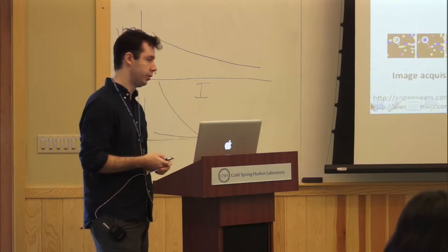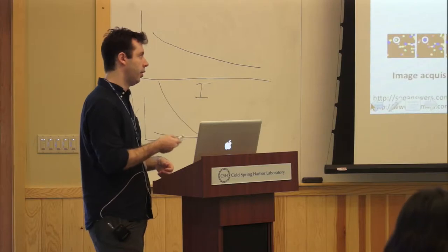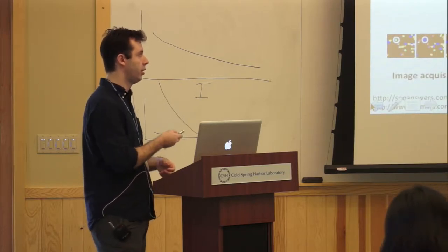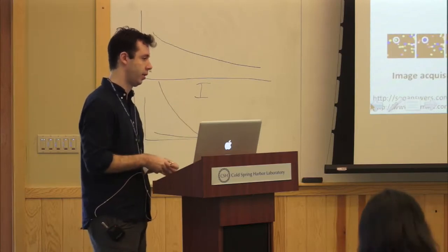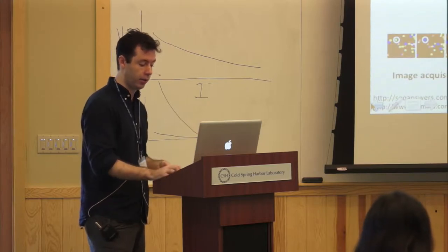Partly software, partly also improving some of the design, including the location of the primers on the lawn, so as to minimize this effect. That's led to a huge increase in sequencing capacity.